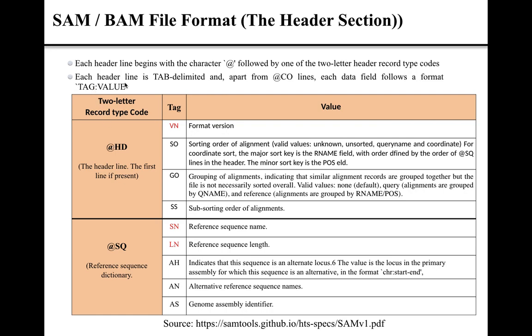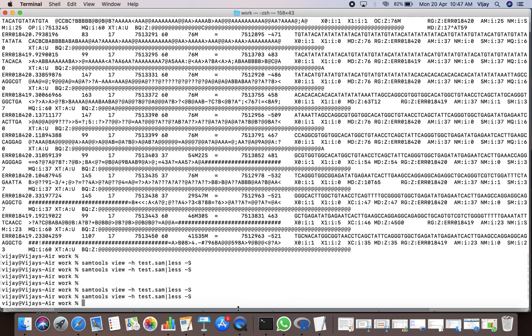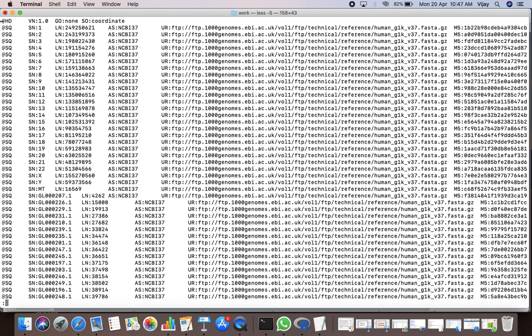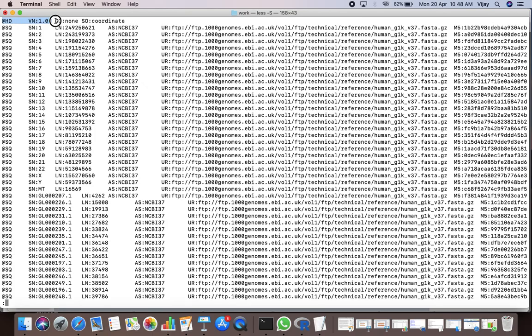Each header line in a SAM file format is tab-delimited and follows a tag:value format. In our test.sam file, the fields in the header section are separated from each other by a tab. This is the first field, the second field, the third field, and the fourth field for the HD line. Only one HD line per SAM file is allowed — multiple HD lines are not supported.